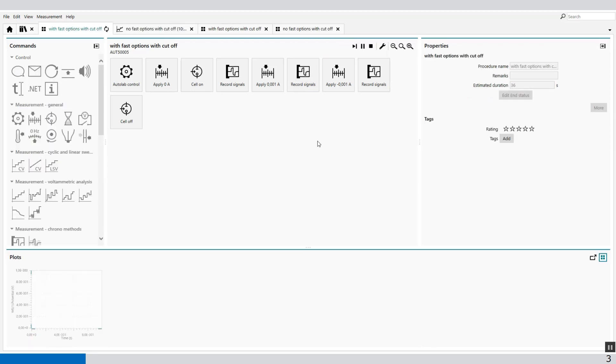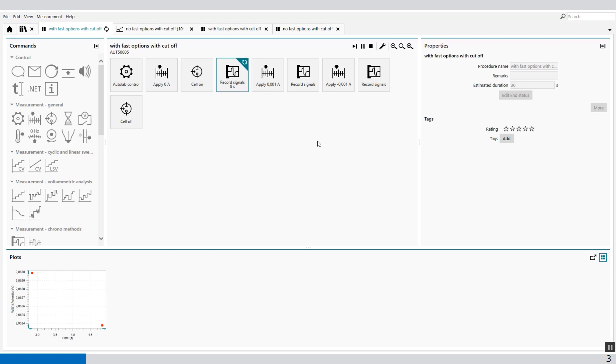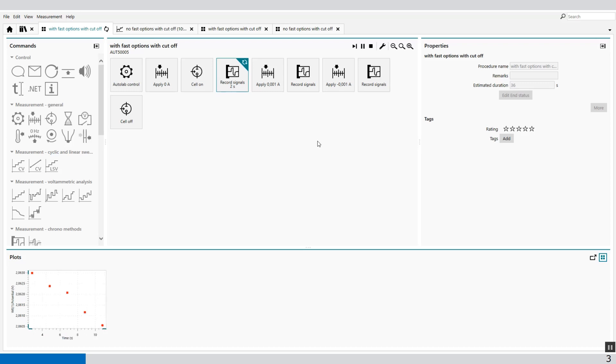When I press play, again for 12 seconds I will apply 0 amps, which is the same as the last procedure. And then I apply 1 milliamp.